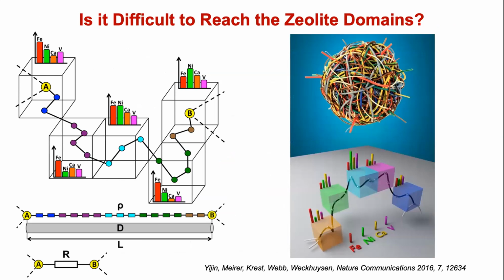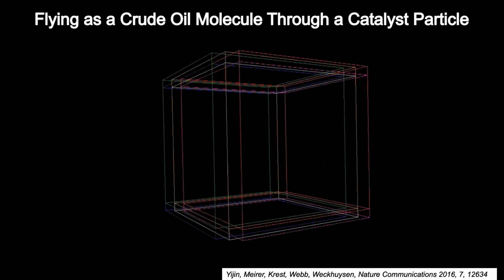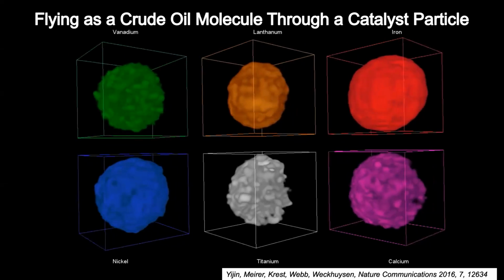Okay, what we did is we identified all the elements, iron, nickel, calcium, vanadium, many of them. And then we said, can we now make it as a resistor network? So if I want to travel through the pores and I'm meeting a lot of metals, then it is not easy to go further. So that is this resistor. And then when you go from A to B, you determine in these voxels the elements, and then you actually go further and see. And that leads to this movie. This brings all the results together of where the elements are in 3D with X-ray fluorescence.